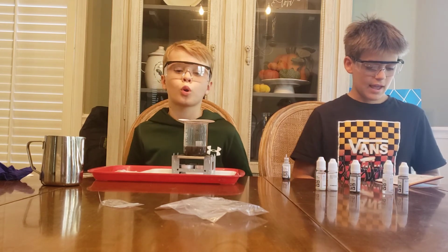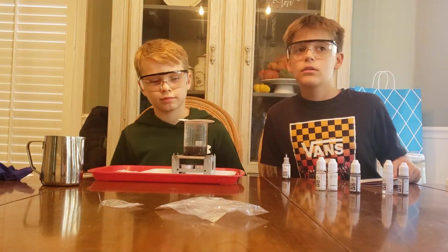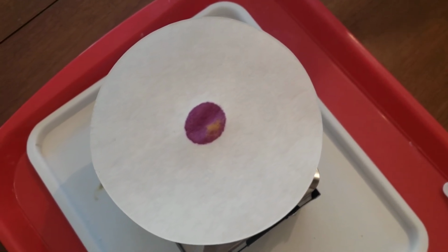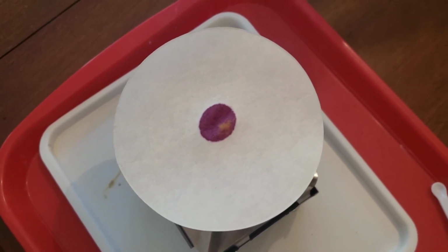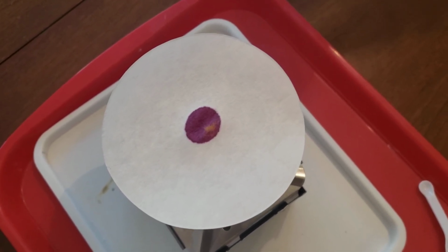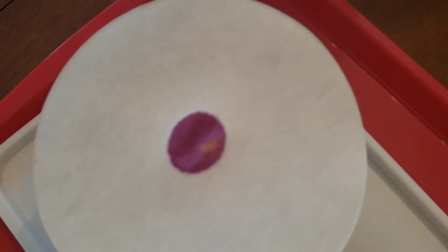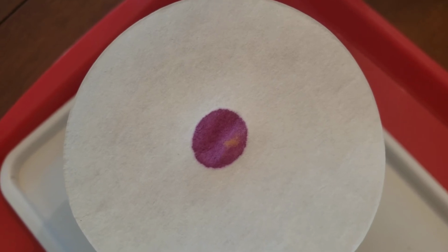It's turning purple. Oh, it's purple. Okay, so it looks like a purple color now. I really don't know why. I'm reading this, okay, so step 7 says thymol blue turns yellow or red in the presence of acid. So the acid gas that's coming up is making the colors different.